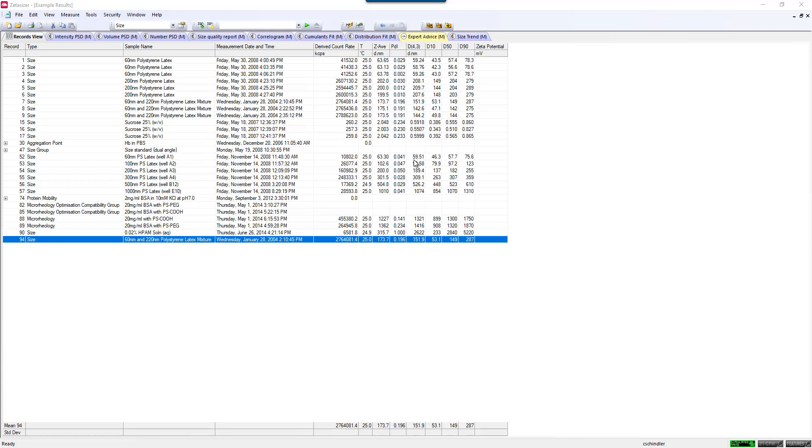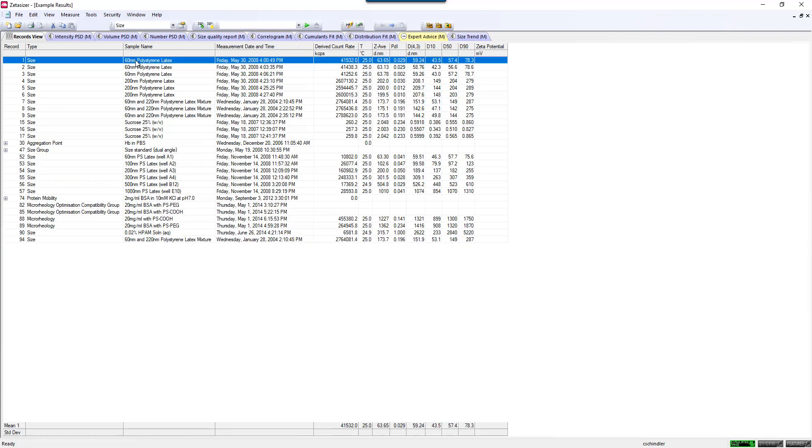All of those can be done in the software pretty easily. The first way I'll talk about is, let's say I just want to have a table summarizing all of the data for the different samples I've measured. One of the easiest ways is, in a previous video I showed you how to customize your workspace.